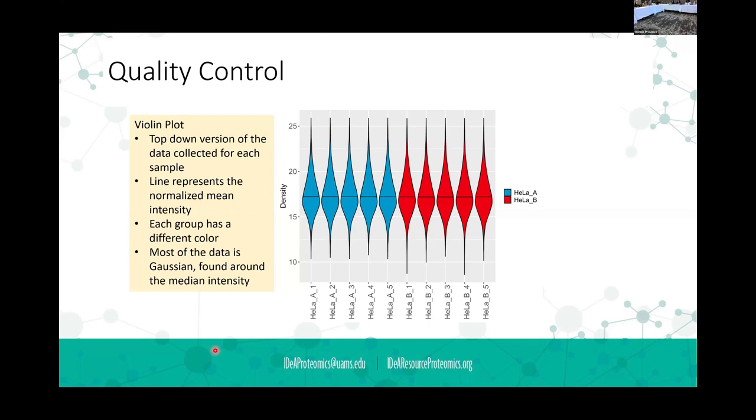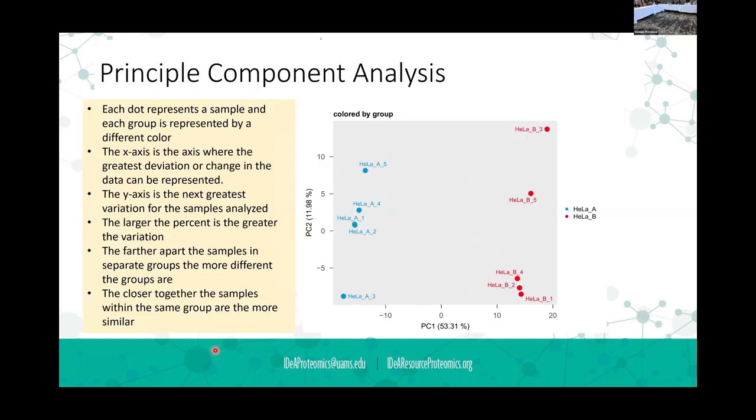All right, perfect. So yeah, again, the normalization kind of makes people nervous. There's a couple of things in bioinformatics that people kind of get a little nervous about. Normalization is one of them, and imputation is the other one. And imputation means where we magically make those NAs into a number so that you can get some log fold changes, and everybody wants somebody else to make that decision and do that. Anyway, we'll cross that bridge when we get to it. All right, let's move on.